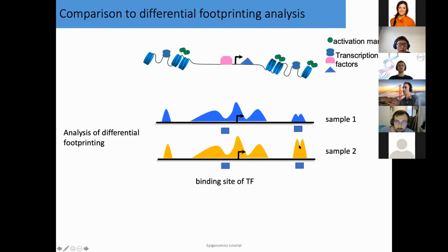So here, for example, it is higher, more DNA was protected than here. But you wouldn't know whether these are at the locus of genes. So it's basically just genome-wide. It's an interesting analysis for seeing which factors seem to be strongly changing, but of course you don't have a direct connection to gene expression regulation.